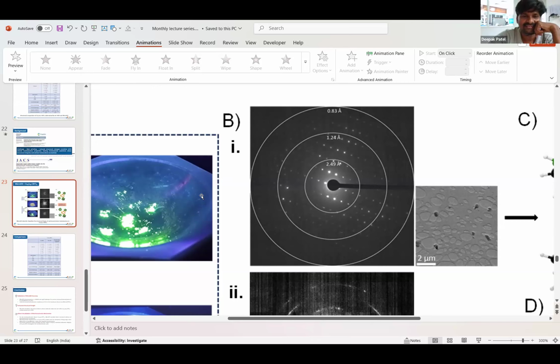Then how can we distinguish this effect from multiple scattering? Or can we not? That's why for electron diffraction we have to do dynamical refinement. Dynamical effects become more important here because there are higher chances of multiple scattering. That's why Lucas brought dynamical refinement into it. In the case of single crystal XRD, it only works with kinematical refinement. But your crystal is really, really thin, right? That is your USP, what you started with. But here we have not used dynamical refinement. Here also we use kinematical. We are not considering the multiple scattering effect for this case.